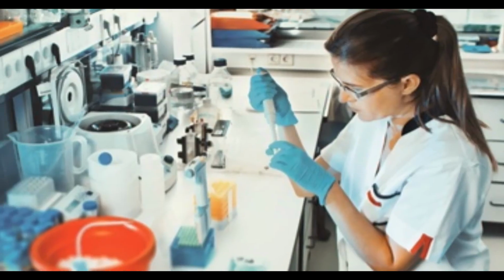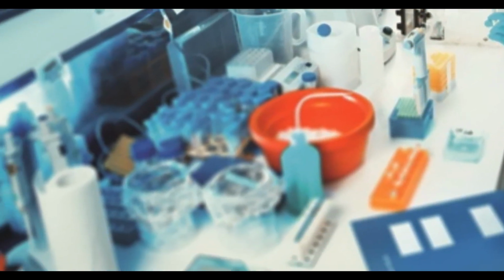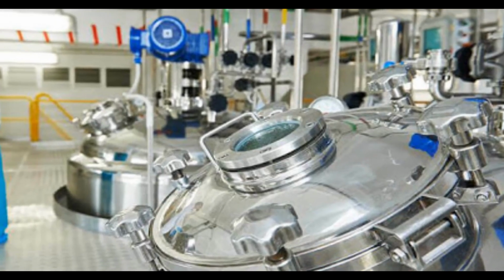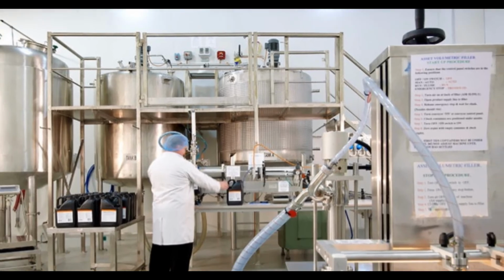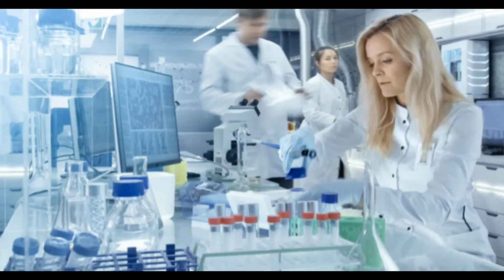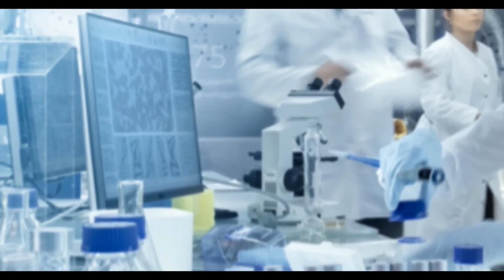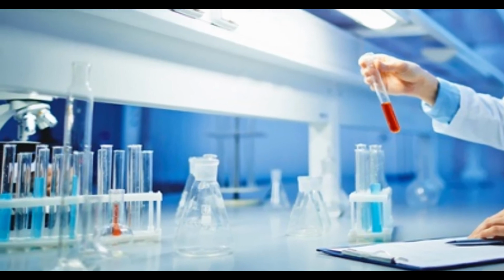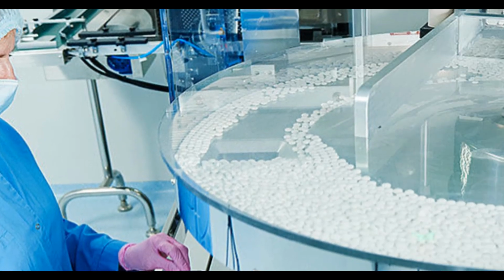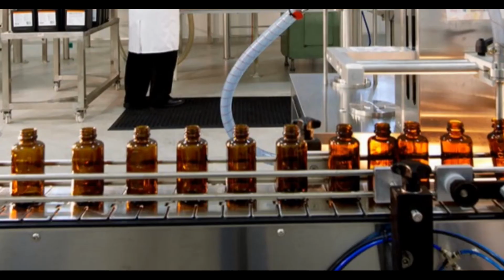Advantages. First, mostly it is used to study enzymes and proteins in the pharmaceutical field. Second, in the pharmacy world, affinity chromatography is used to check the quality of the proteins and the enzymes which are present in the formulation. Third, it's also used in the genetic engineering field for gene therapy and identification of genes. Fourth, it is also used during the production of vaccines. Fifth, this chromatography is mostly used in pharmaceutical companies in the production department of vaccines for maintaining the quality of the product.